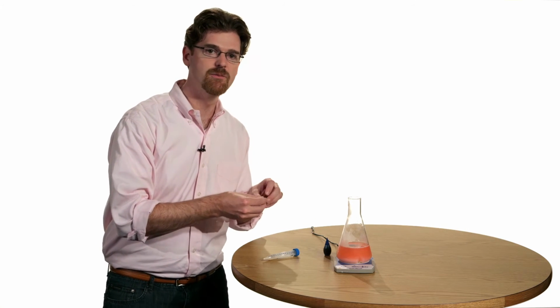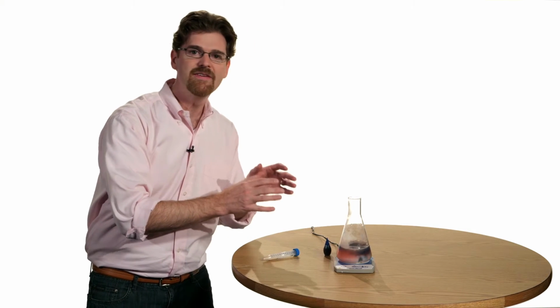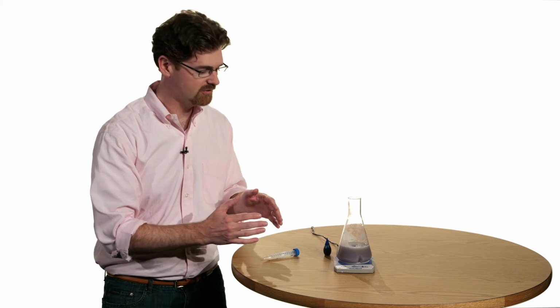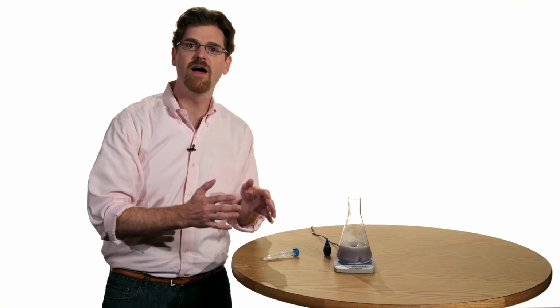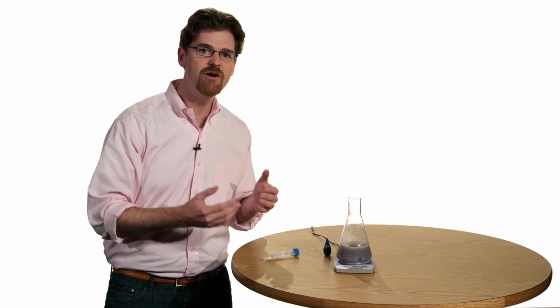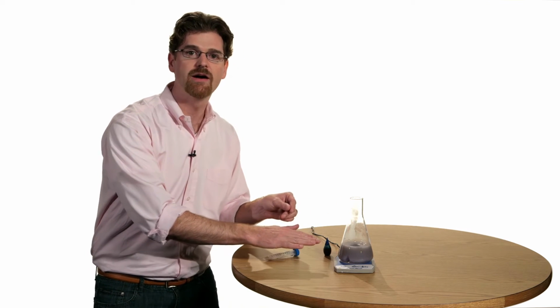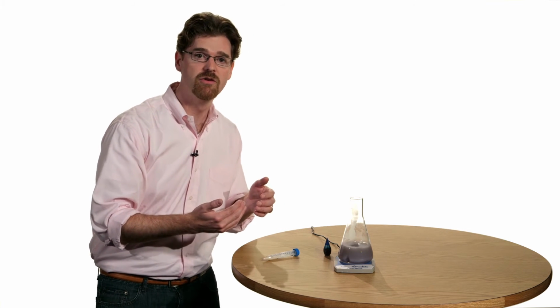So let's mix the system by stirring. This added protocol increases the homogeneity in the system, but it also introduces additional factors like shear forces on the cells. We'll look at the finer points of how stirring affects oxygen transfer and cell integrity later, but for now, this idea makes it possible to expose the cells to a uniform environment throughout the reactor. We can now let this batch culture of cells work for us.